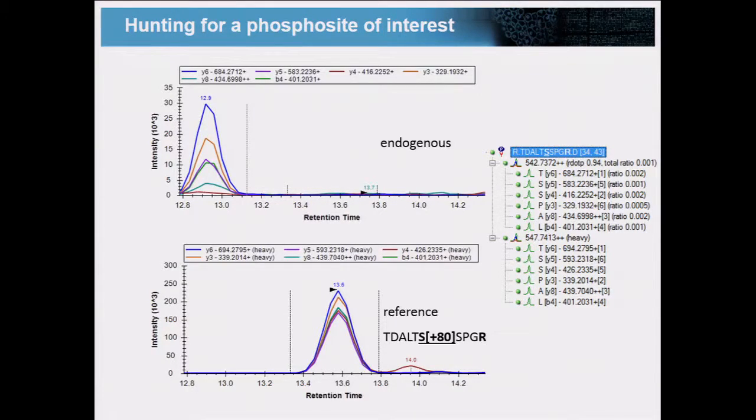Correct, or probably correct, I would say. What can happen is that I ordered here a reference peptide because I looked at shotgun data. I thought this is the correct site assignment. But in fact, when I go to the endogenous, the site assignment was wrong. And now we get a peak that is eluting at a different time. Another option that you should consider is maybe there is some modification that is very, very small, which creates a shift in retention time. That can also always happen.